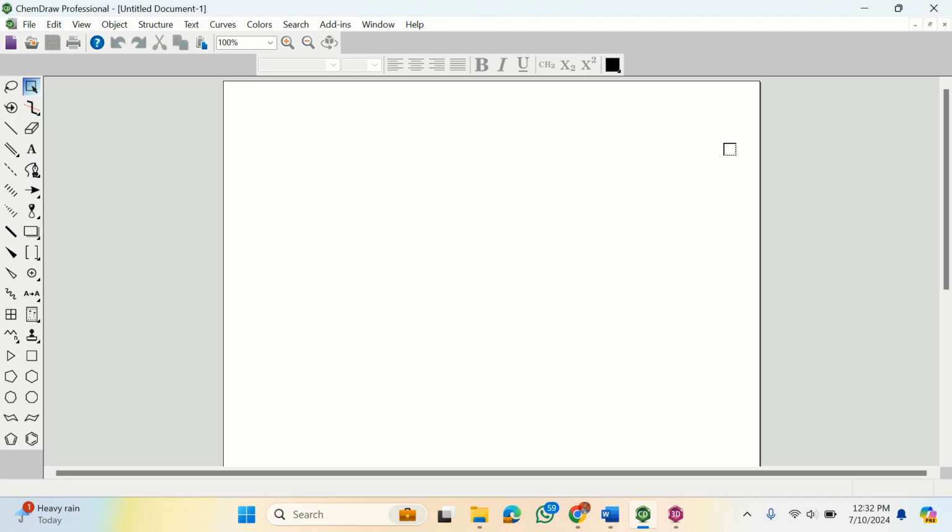I mentioned when you synthesize the compound, and then you needed to perform docking with that particular compound, you won't find that compound in a database because it's yet to be uploaded there. So what do you do? You will draw the compound in ChemDraw, and then convert it.